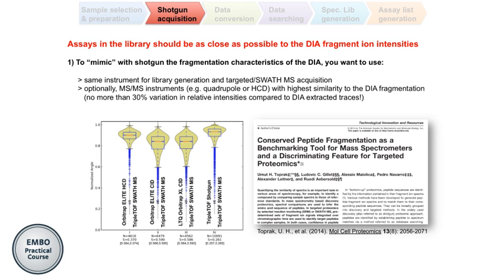So I guess then my follow-up question is, why would you stop with spectra? Why wouldn't you use spectra to seed SWATH measurements that you then use as your assay library?